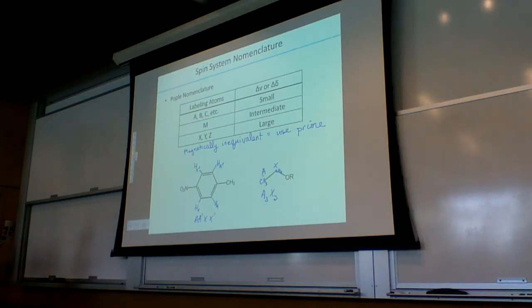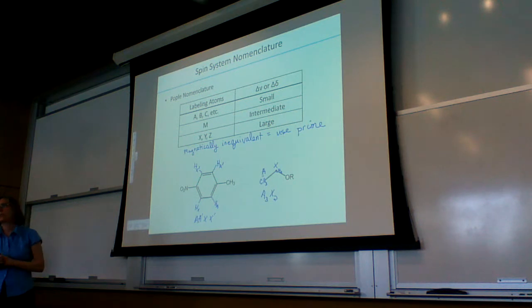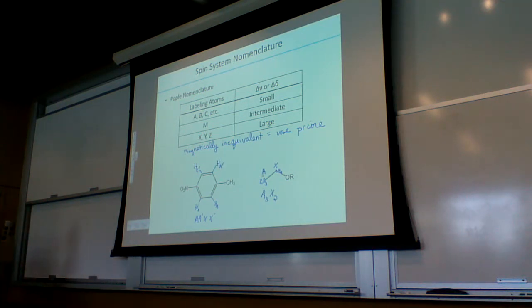So we have 4 different protons we're looking at, even though we are going to only see 2 sets of signals, and they'll integrate as 2, but you'll see some extra splitting when they're splitting each other. So the magnetic equivalence, is that something you see on the NMR, or is that something you see on a different scan? No, we'd see it in the NMR in this case because we'd see that really tiny splitting. So it's a J4 coupling.